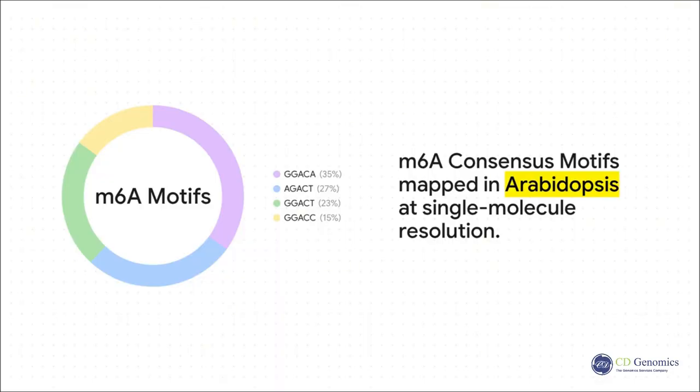Let me give you a real-world example. In a really foundational study on the Arabidopsis plant looking at flowering times, researchers used this exact technology to map exact M6A sequence motifs at single-molecule resolution.